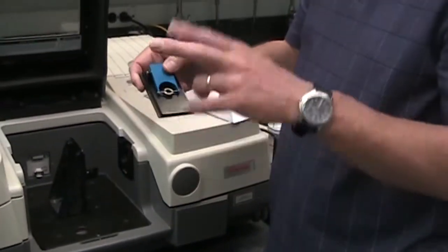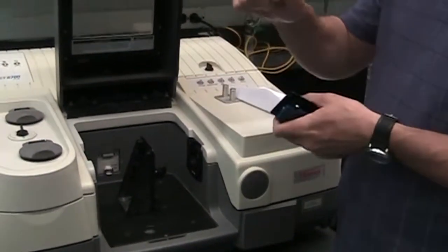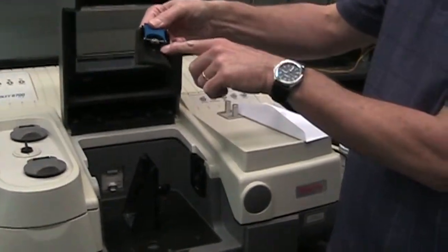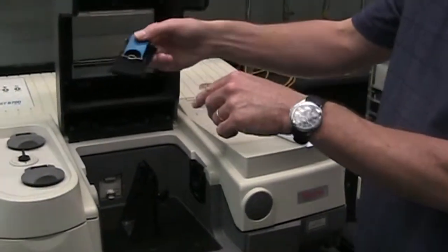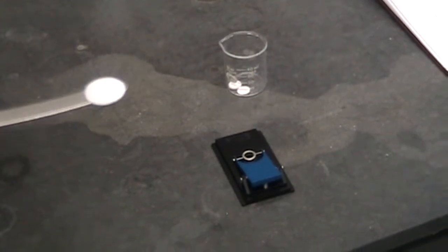And you're going to use salt plates for two different reasons. One is you're actually going to make a KBr pellet, which is a salt plate. And the other is you're going to make a Nujol mull with your sample ground in oil, and you're going to smash that between two salt plates. But in any case, the salt plate can be held in place by the same thing that was holding the film in place. So here's not a very good quality KBr pellet, so ideally it would be a little more transparent than this one is.